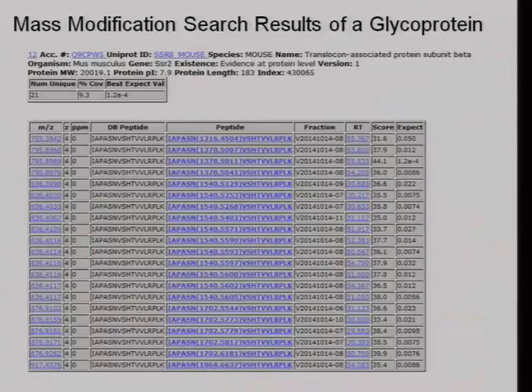And you can sometimes get structural information. As I said yesterday, you can tell the software to acquire CID data, and only if you see these sugar ions, then acquire the ETD data. So you don't have to acquire CID and ETD on every precursor. Although, if after your enrichment 80 to 90% of the things are glycopeptides, then you might as well acquire both. It doesn't save you much time.